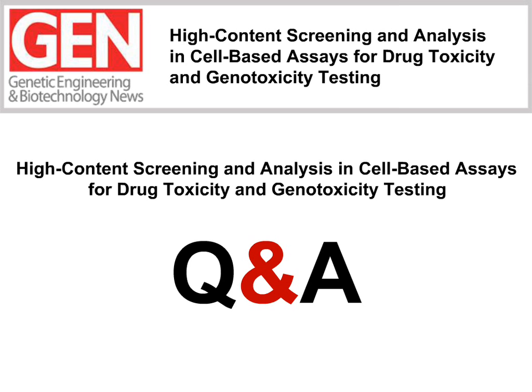And I know that with the Operetta system it's possible to quantify the differentiation. Also this device allows us to, for example, investigate if there are some modifications in the cytoskeleton. So I think that a first next step in our research would be to try to quantify the differentiation of the cells by using the Operetta.